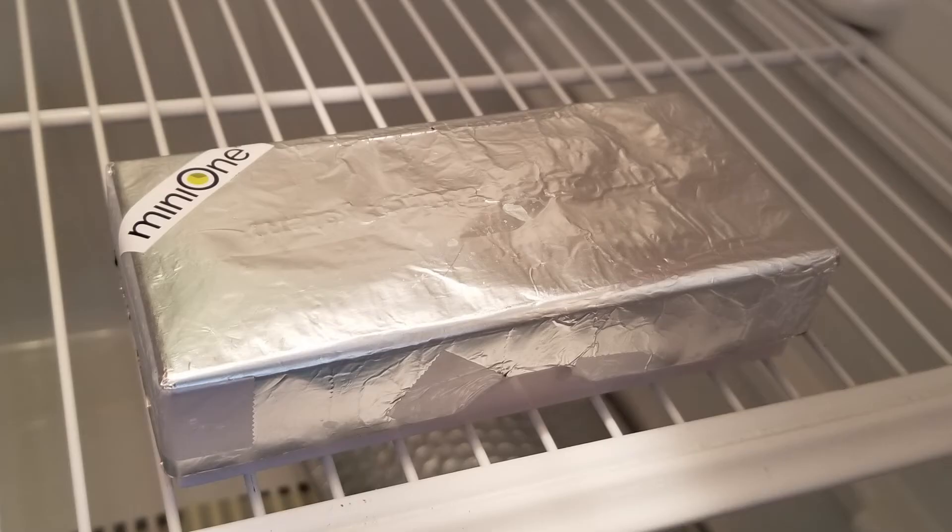Remember, gel green cups contain a light-sensitive DNA stain, so keep them protected from light as much as possible. A good way to do this is to wrap the casting stand in aluminum foil.